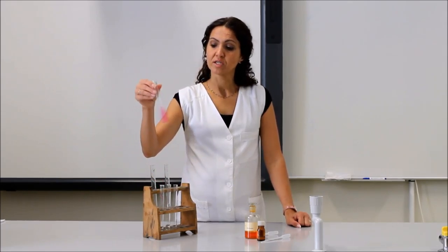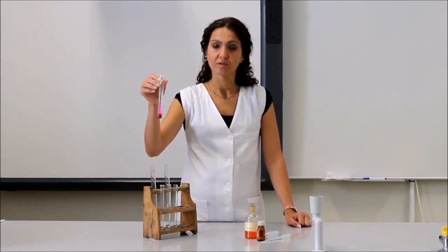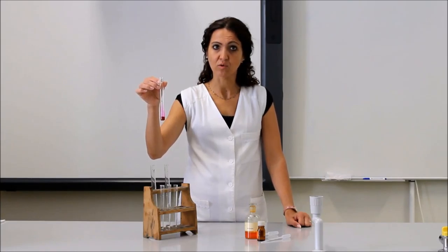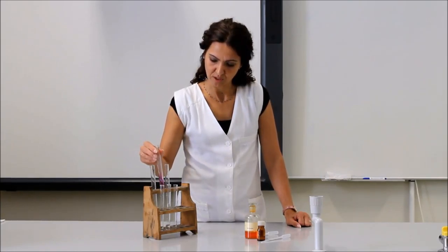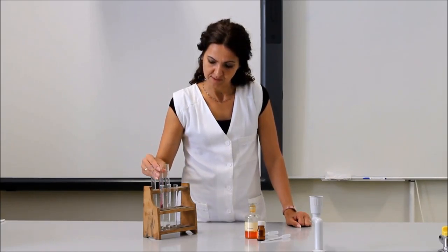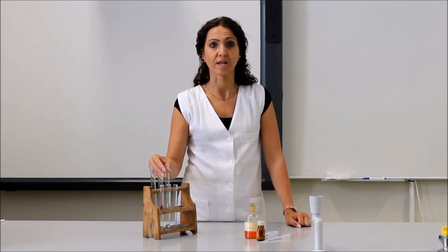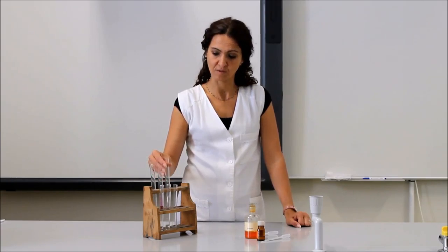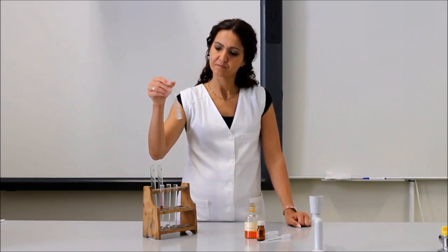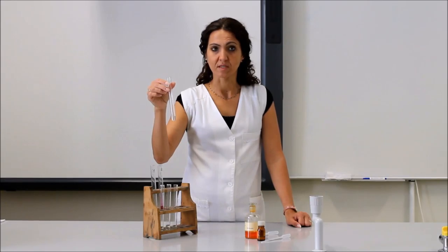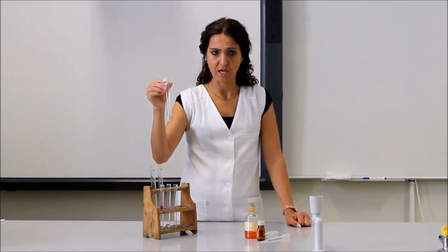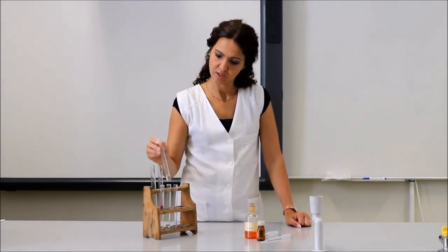A második kémcső rózsaszínű lett, ez a lúgos kémhatású oldat, ami kizárólagosan azt jelenti, hogy ez a nátrium-hidroxid oldat. A harmadik kémcső szintén színtelen maradt, az azt jelenti, hogy a kémhatása savas vagy semleges. Szükségünk van arra, hogy az első és a harmadik kémcsövet meg tudjuk egymástól különböztetni.